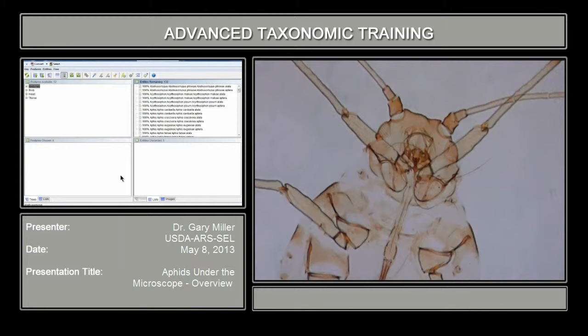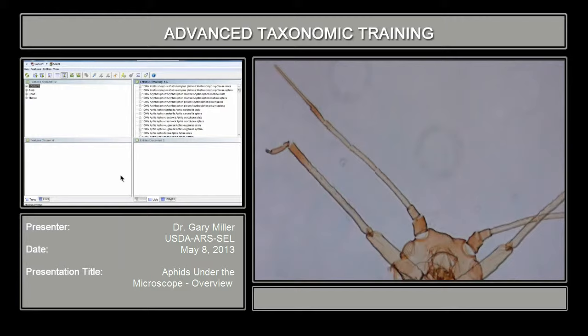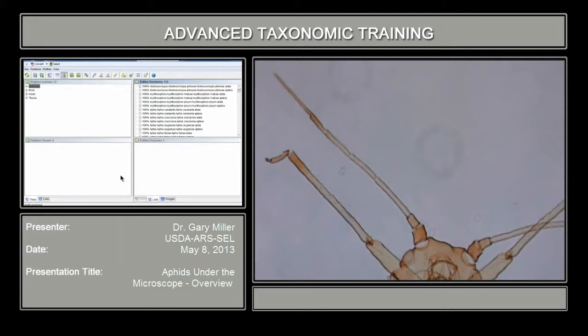Some of the structures you're going to be looking at and concerned with are antennal structures. We're going to start from the head and work down towards the caudal area. With aphid identifications, you'll often see a couplet that will talk about the terminal process, which is the last antennal segment — that's this structure here. You also have the base, which is also part of the last antennal segment.